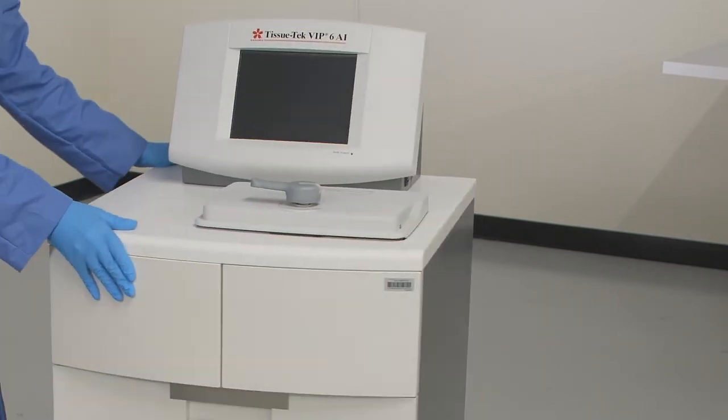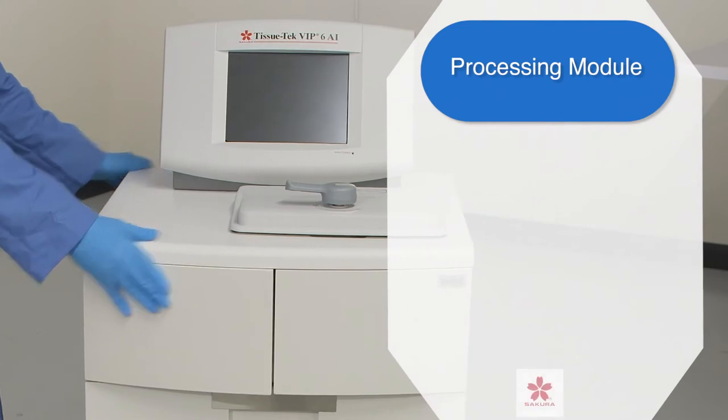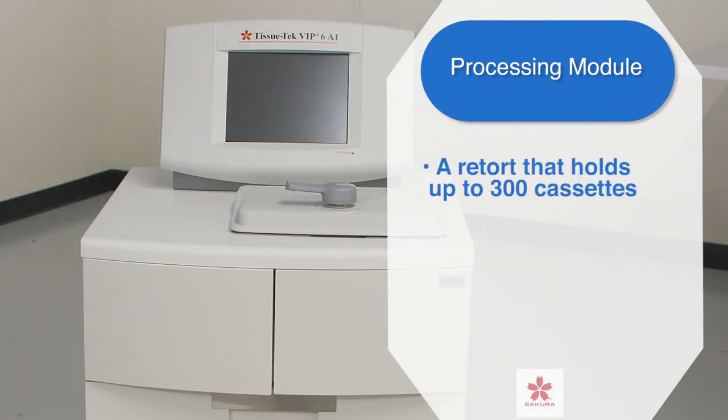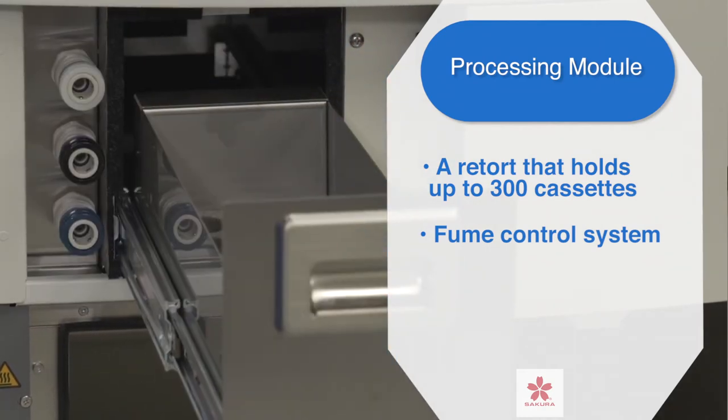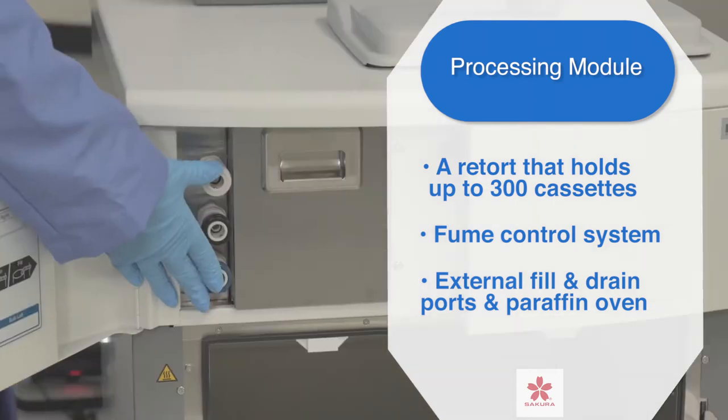The processing module consists of four sections: a retort that holds up to 300 cassettes, the fume control system that is constantly purging fumes from the retort and oven compartment, external fill and drain ports, and the paraffin oven.